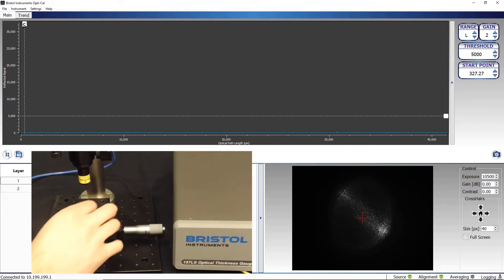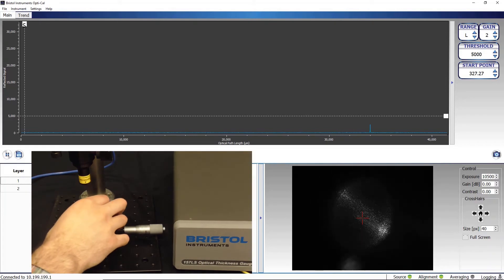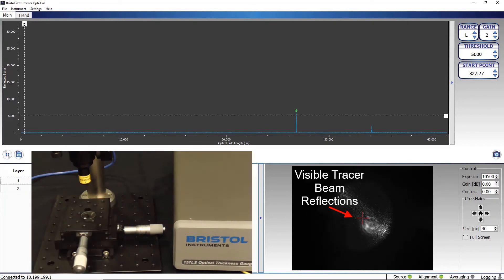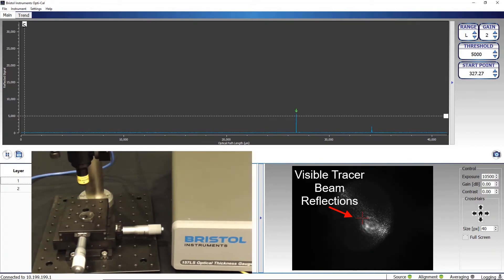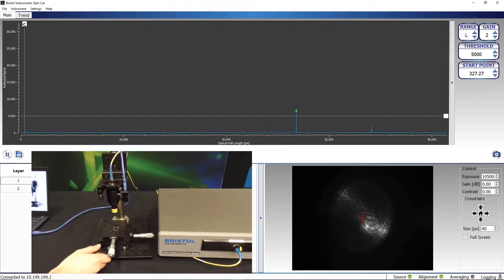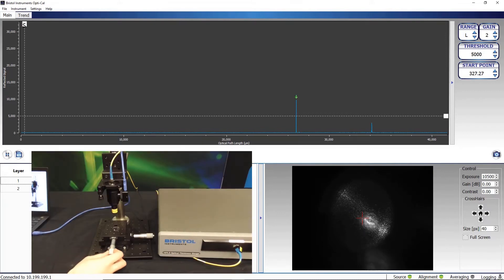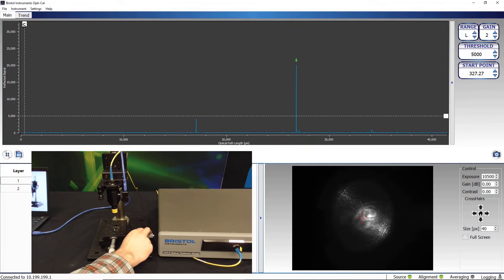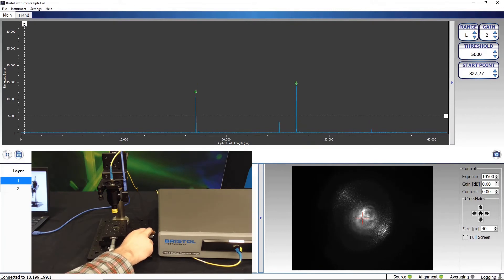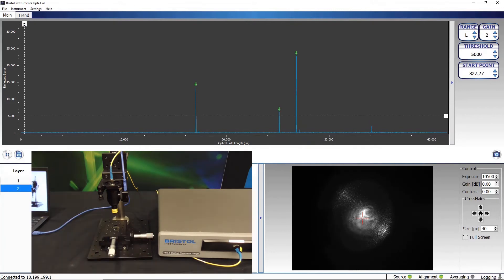The integrated camera on the probe allows for easy alignment by showing visible tracer beam reflections. By simply adjusting the X and Y stage positions until the reflections are at the crosshairs of the camera, the doublet is aligned.